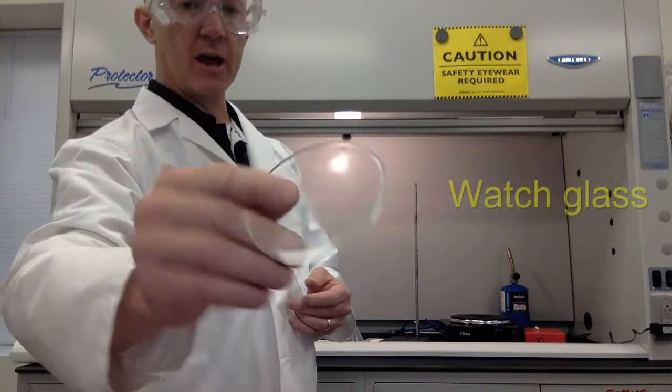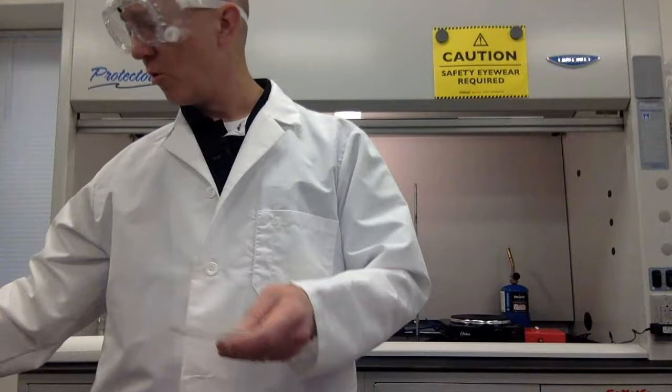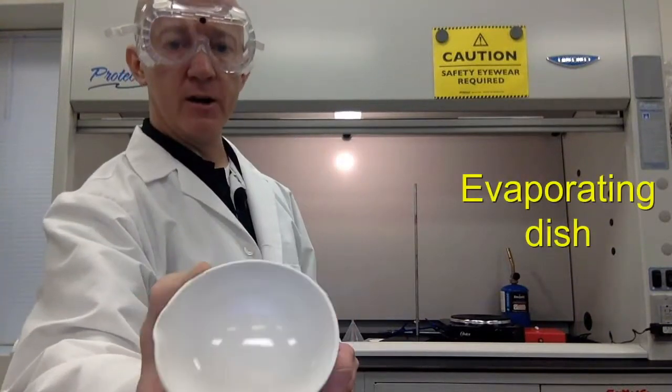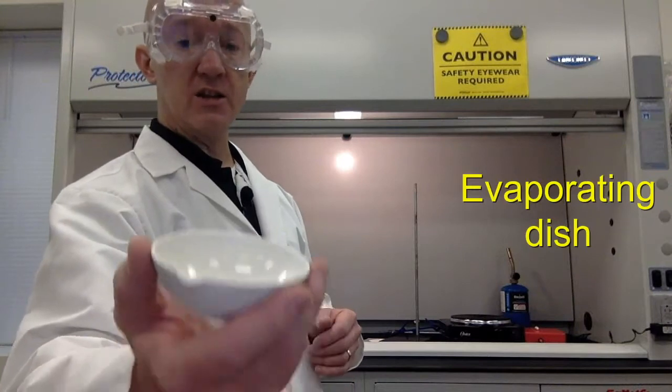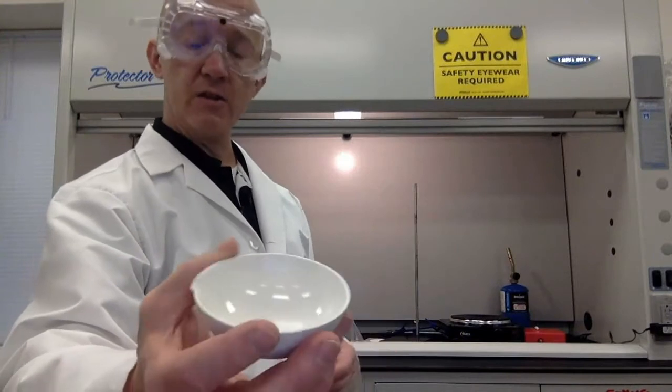This is a watch glass. This can be used in various ways from allowing a wet solid to dry or to cover a beaker like so. This is called an evaporating dish. We can gently heat a stable solid in this evaporating dish. And it will take the liquid away, leaving the solid.